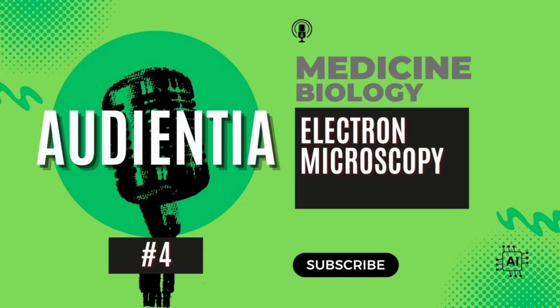How does it work? What makes it so powerful? Electron microscopes use a stream of electrons instead of light. This stream is generated by an electron gun, which produces a beam that behaves similarly to light, but with a much shorter wavelength. Because of this short wavelength, electron microscopes have a very high resolving power, allowing us to see details on the nanometer scale. In fact, depending on the technique, EM can achieve magnifications of up to 1,000,000 times.